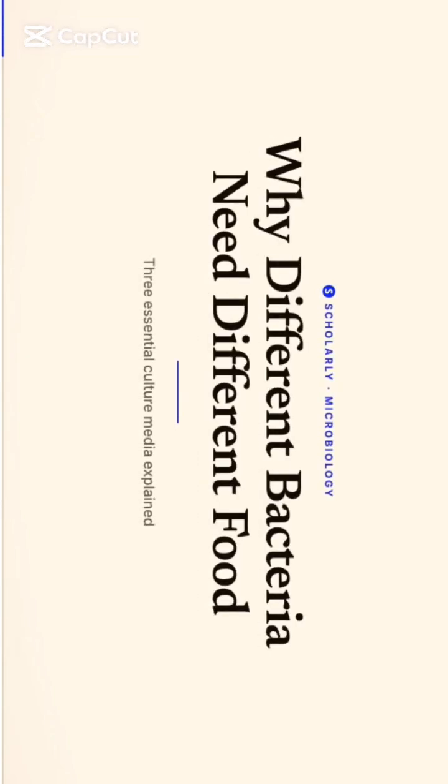Not all bacteria are alike. Some thrive on simple nutrients while others demand blood, chocolate, or bile salts just to grow. So how do microbiologists pick the right food for each pathogen? That's what this video is about, the 3 essential culture media that turn invisible bacteria into visible identifiable colonies.